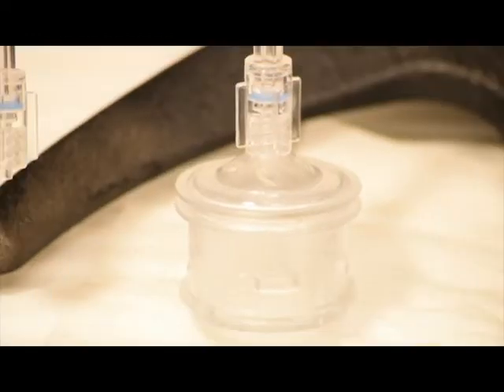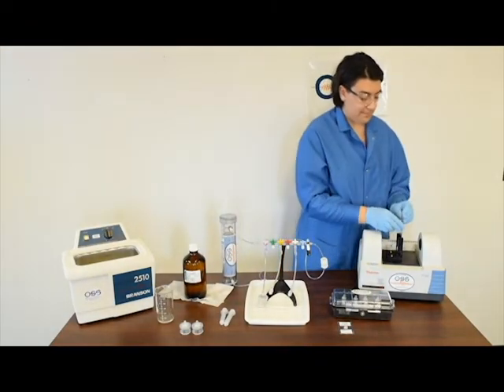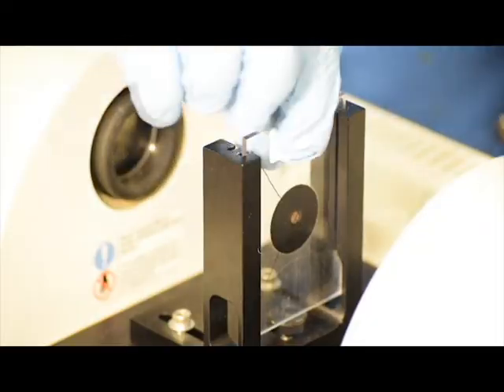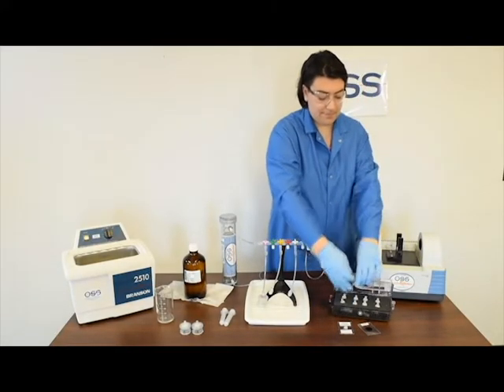Prior to analysis, the OSS alignment card is used to ensure the infrared beam is properly aligned for the luer lock opening of the extractor. Then, simply use OSS-provided solid-state calibration standard devices to validate the FTIR unit.